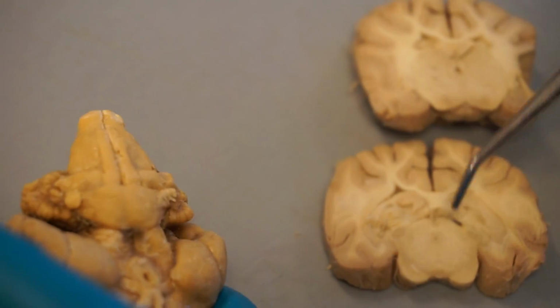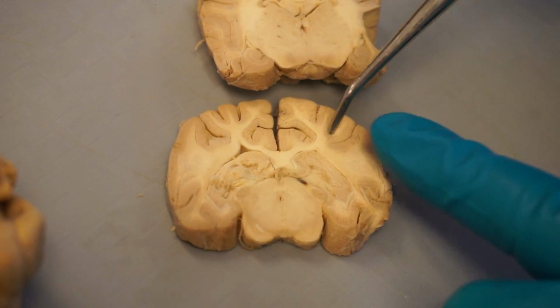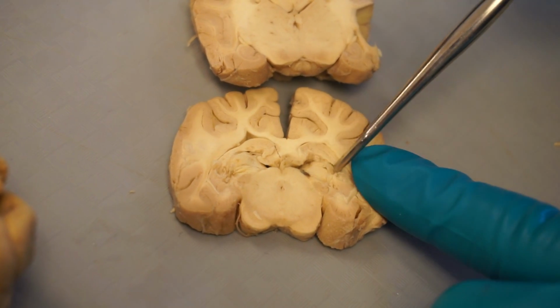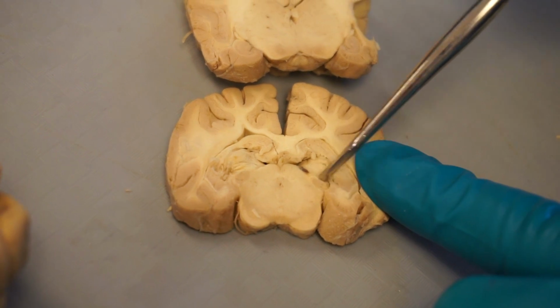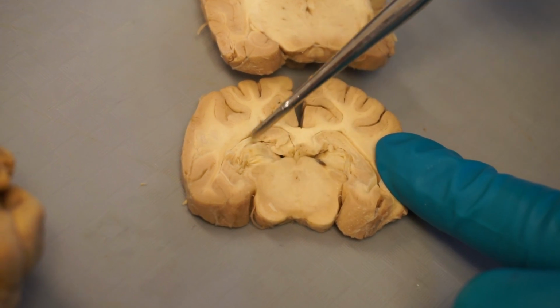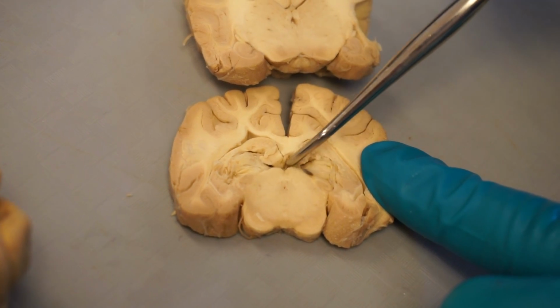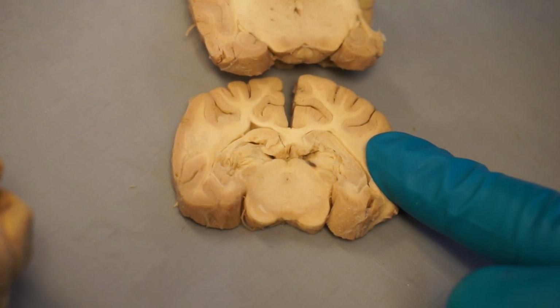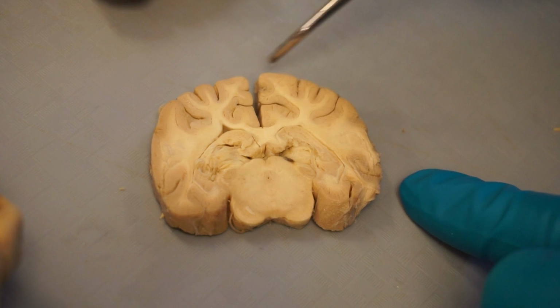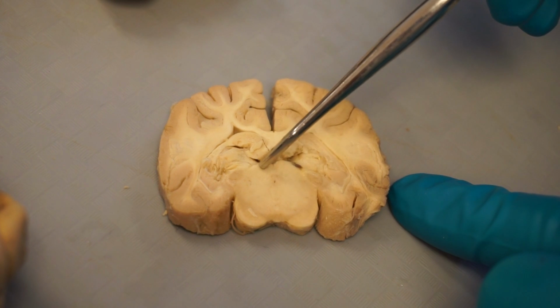Okay. So we know we have mesencephalon. Here's a beautiful mesencephalic aqueduct. As it turns out, in the way that we've cut this particular section, we can see our lateral and medial geniculate bodies. They're more dorsal and ventral, but lateral and medial geniculates. And catching the beginning of these two little bumps at the top, that would be our rostral colliculi. So in this particular section, we'd have telencephalon, diencephalon, mesencephalon.